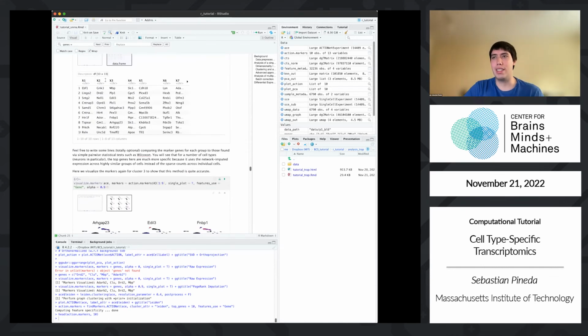And we can pull out, let's say, all the canonical markers here. These are oligodendrocytes. We can see MBP, PLP1. We can see that these are our D2 SPNs. We have expression of DRD2. Over here are astrocytes. We have APOE, GPC5.